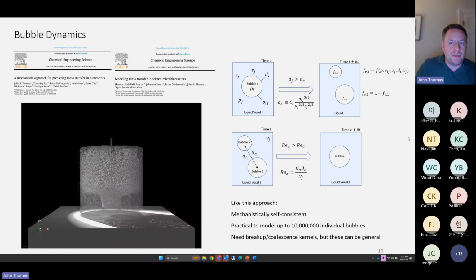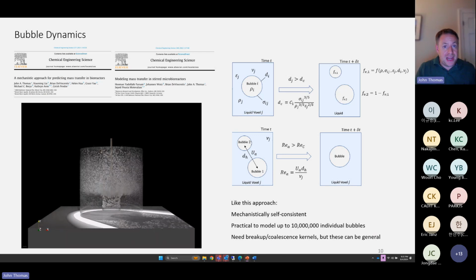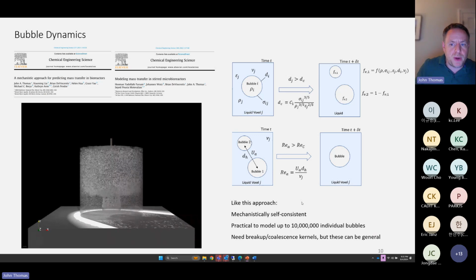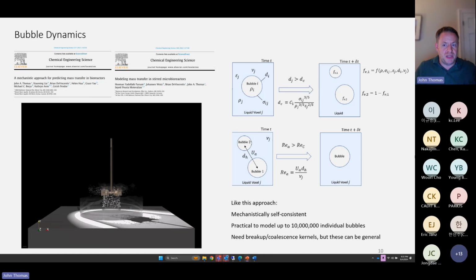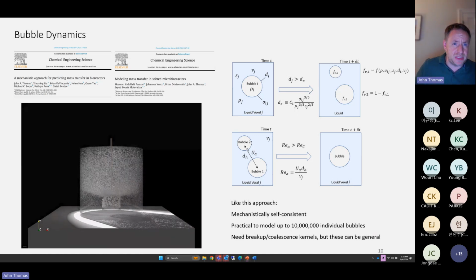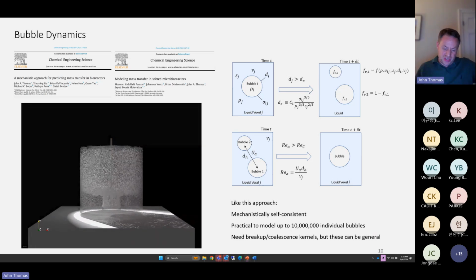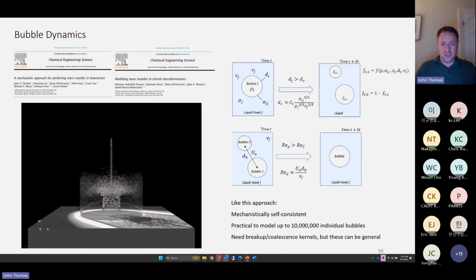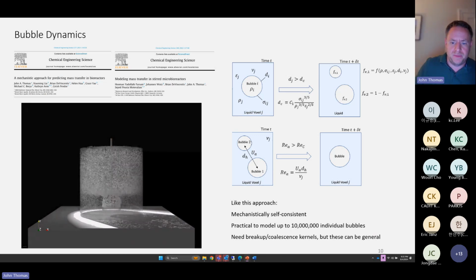And when we use these bubble-level approaches, we have a very generalized modeling approach that doesn't need to be changed between different operating scales or operating conditions. Said again, our breakup mechanics rules, which we talk about in depth in our literature, appeal to first principles relationships such as EDR informing bubble breakup, or first principles coalescence relationships. They don't change between scale or operating condition. All the changes in vessel type, vessel scale, impeller speed, etc., the net effect of those changes on things like EDR and coalescence mechanics are folded in organically to the model.